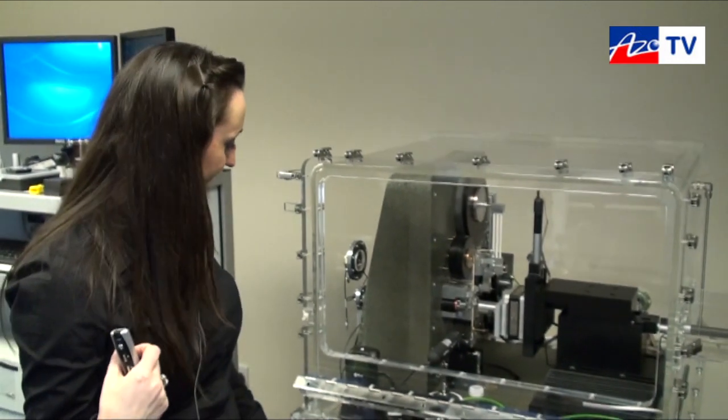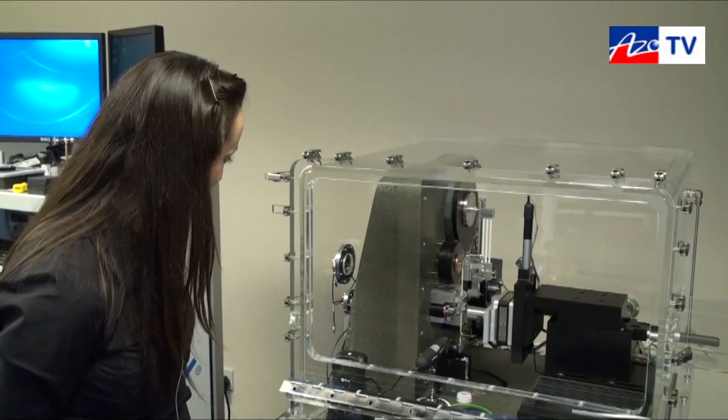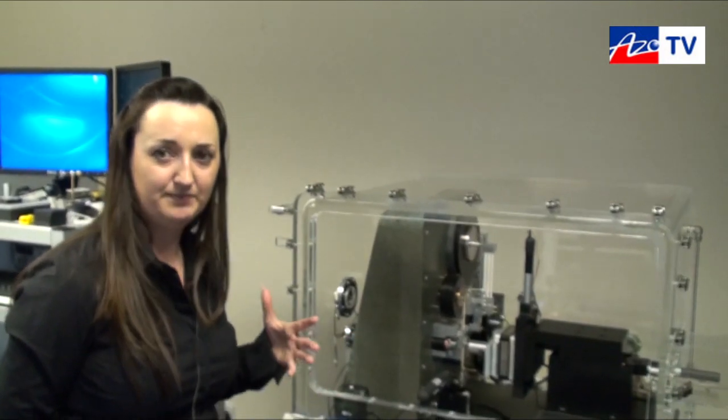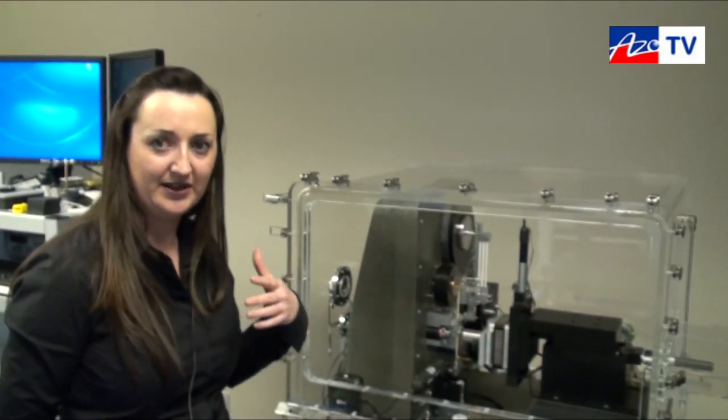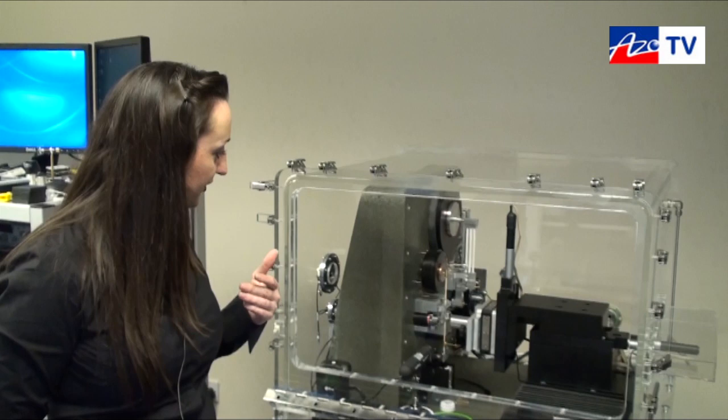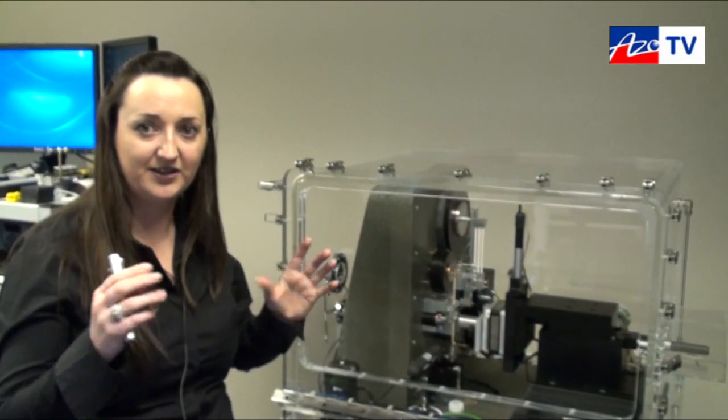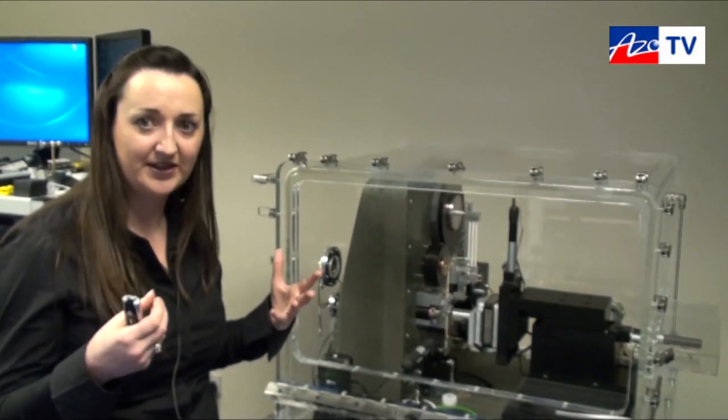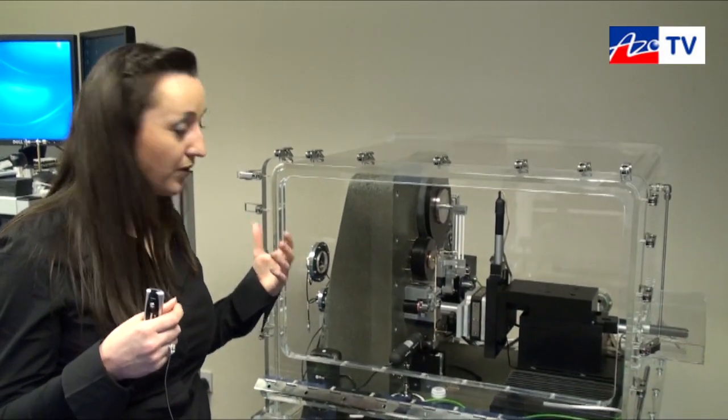Okay, part of the instrument construction is all that granite bases there. Why is it that you use granite? Well granite is extremely stiff. And in any system like this you need a very stiff system. The compliance of the instrument has to be minimal. And also the granite base has a very high thermal mass, so we don't see a lot of expansion and contraction with any kind of tiny fluctuations in temperature. So that's very, very important. The weight it gives more or less anchors the system. And it's very nice to work with.